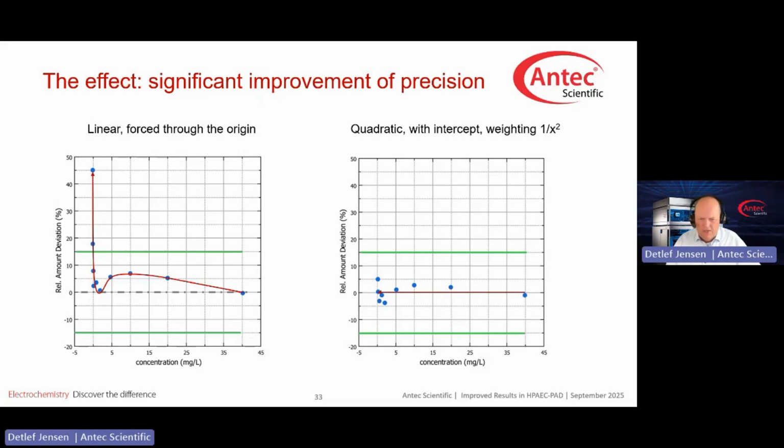And of course, you need to be curious, you need to be skeptical, and you need to check that this works for you. My recommendation, don't do extra experiments, don't do extra work. Use the data that is already existing on your computer, the data that you already have. Apply it to that evaluation. Use different calibration models and select the one that gives you the lowest RSEs.